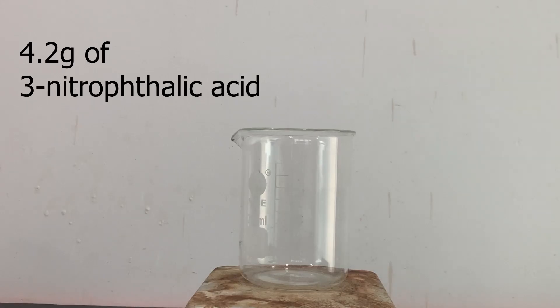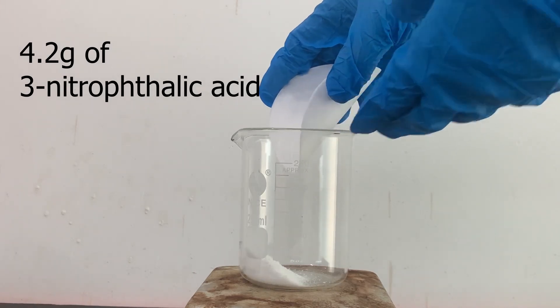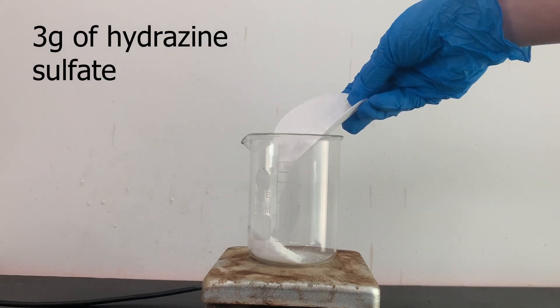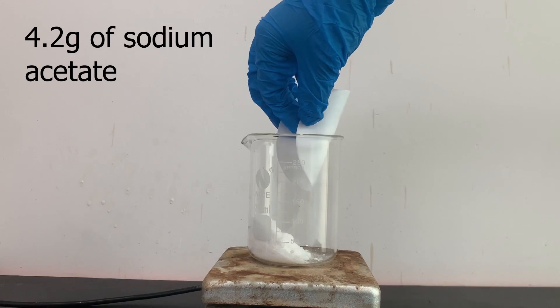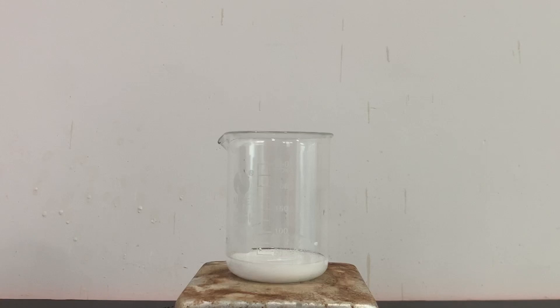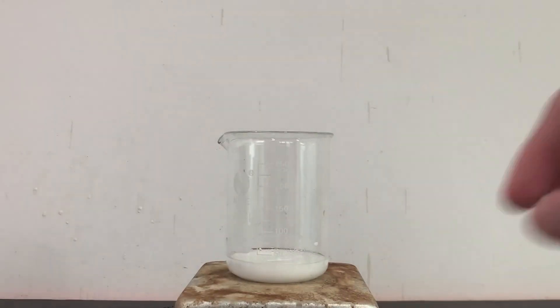Into a beaker, I added in 4.2 grams of 3-nitrophthalic acid. I then added in 3 grams of hydrazine sulfate and 4.2 grams of sodium acetate. I dropped in a stir bar and added 20 milliliters of water. The mixture is heated until everything dissolves to form a solution.